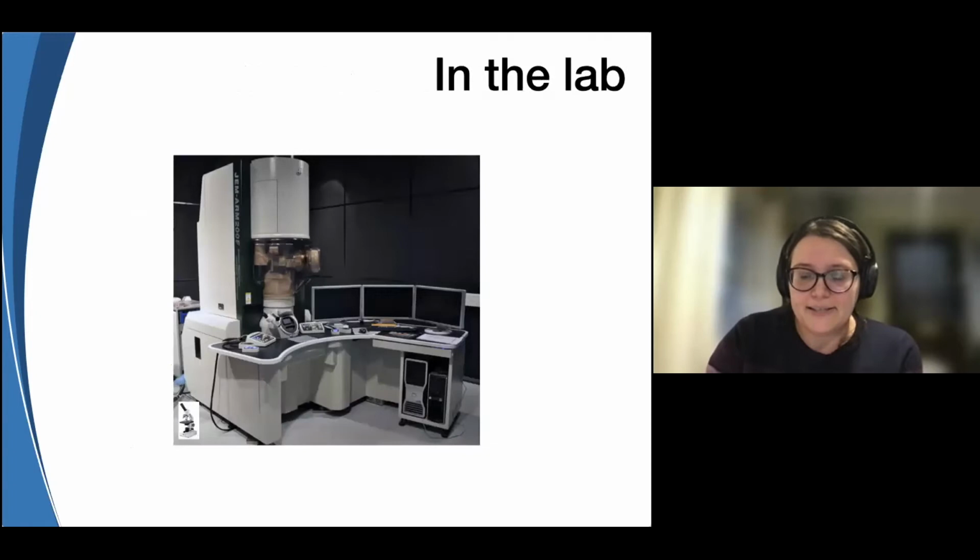So how this looks in the lab is actually you scale up the microscope massively as you scale down the resolution limit. So you can see I tried to indicate a little benchtop microscope sitting on the floor, and our high resolution electron microscope takes up a whole room. Actually, what you don't see in that image is the fact that that room is about 4 times the size of the microscope, because we've got all kinds of other bits of kit in there. And we have a second room that has to contain all of the cooling, all of the power generation, all of the computers. So it's a really big bit of kit.